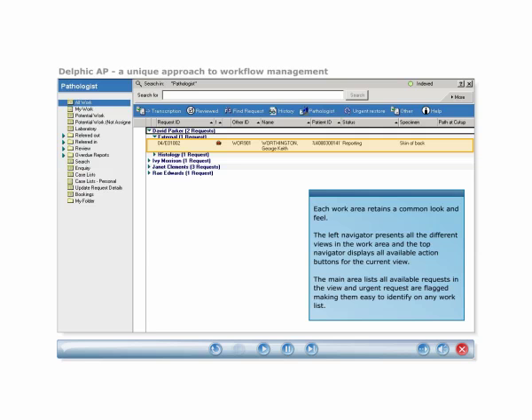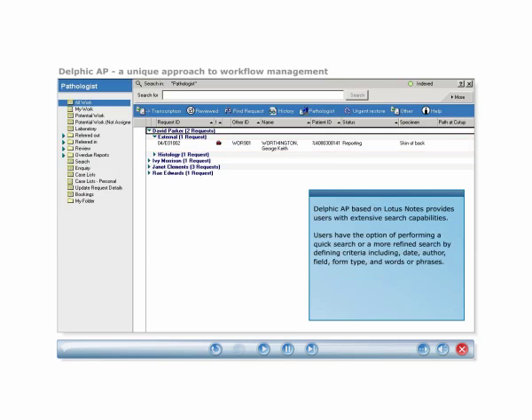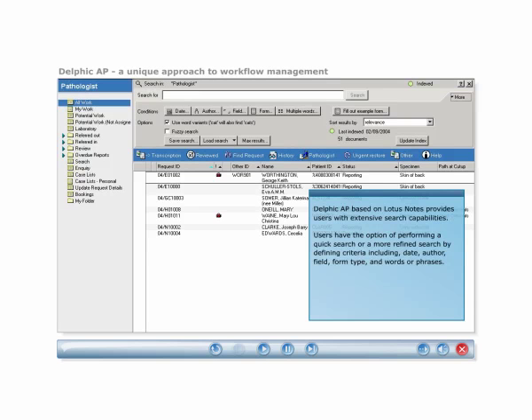Delphic AP, based on Lotus Notes, provides users with extensive search capabilities with sophisticated free text searches on all documents and throughout the database. In addition, users have the option of launching a quick search or a more refined search by defining criteria, including date, author, field, form type, and words or phrases.